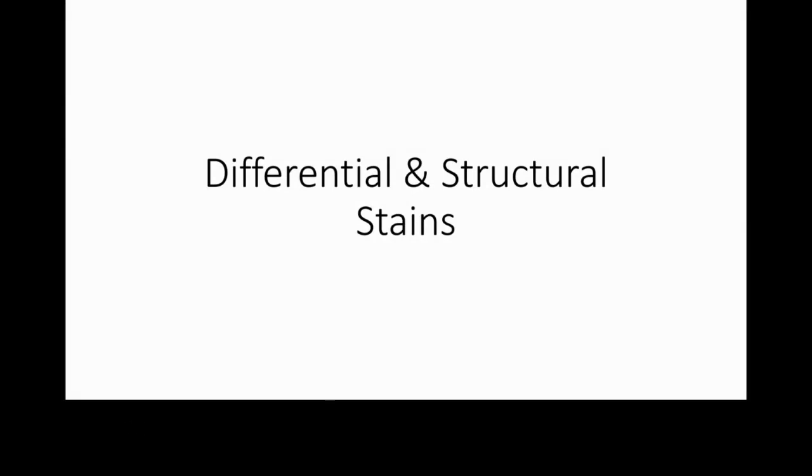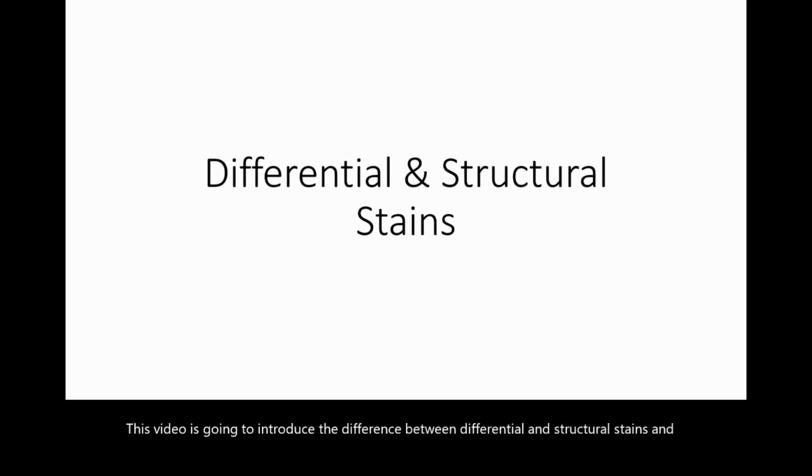This video is going to introduce the difference between differential and structural stains, and then we'll focus on the Gram stain, which is a type of differential stain.